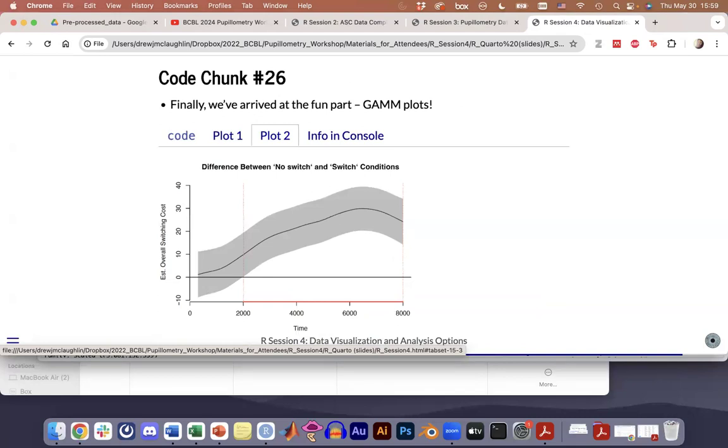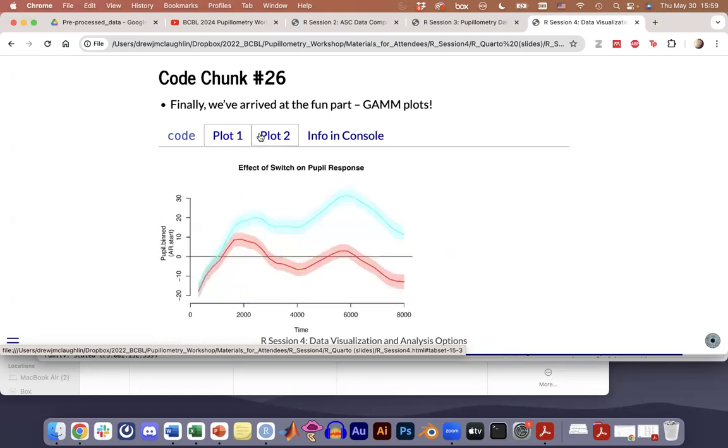It's beautiful, it's very lovely, because in contrast with something like growth curve analysis, earlier you were asking, what does the quadratic interaction even mean? And it's really hard to interpret. And you don't really do these difference curves in this way. This just cuts to the chase and says, these lines are significantly different, but only in this section of the data. So you can look across plot 1 and plot 2. This can be really powerful.